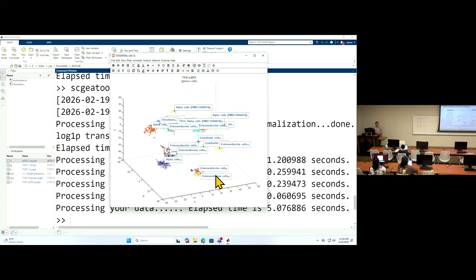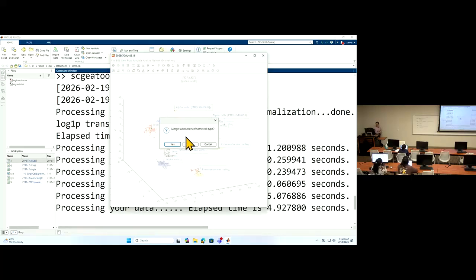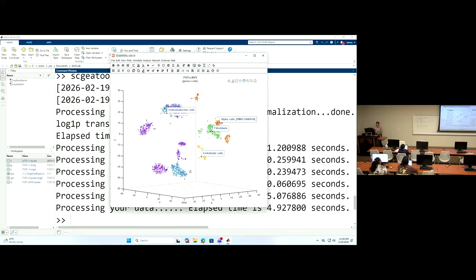They have the same name. They definitely should be grouped together. So that's why once you finish this automatic annotation, normally you just want to merge the same name into one group. So you name them, group them, then you have a final annotation, this automatic annotation, to give you the foundation for your next step, manual refinement of this.